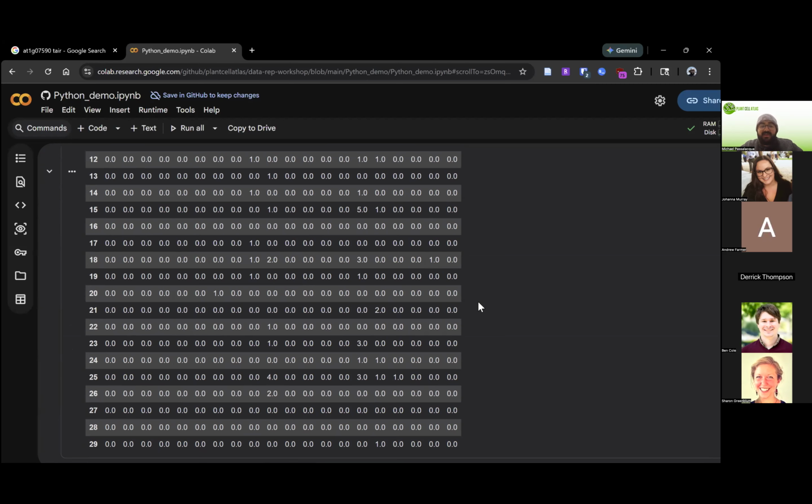going on in the data, because clustering resolution applies to the whole data set. So there are functions in ScanPy and Seurat for subclustering a specific cell type. If you have one cluster that you think needs to be subclustered, you can subcluster only that one. But for that you need to really just look at your data, because there's no good way to pick a resolution a priori without having played with the data.